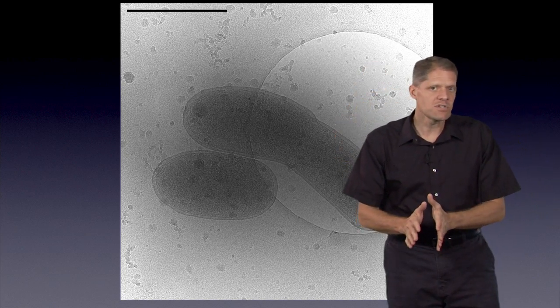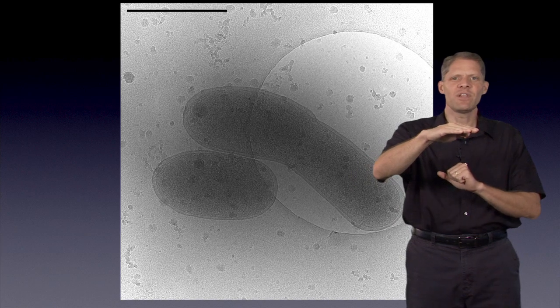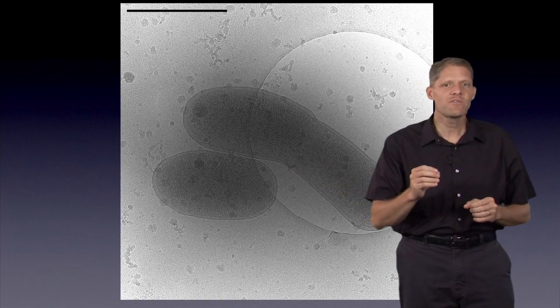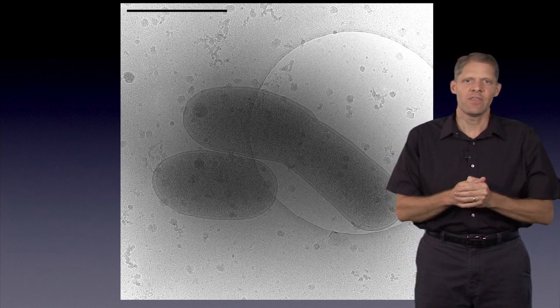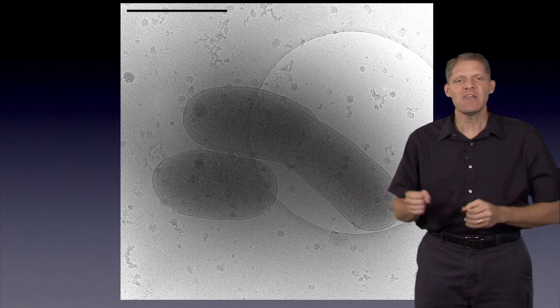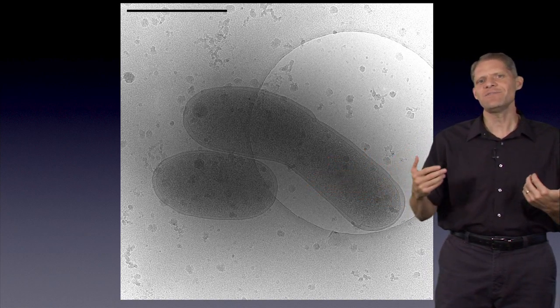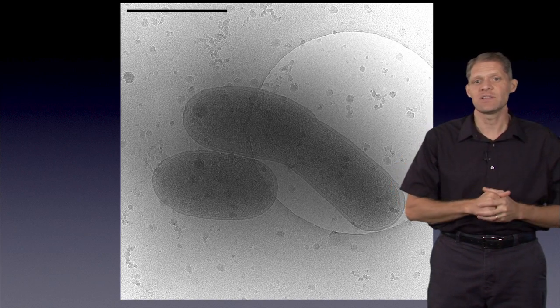And then by keeping it frozen constantly from the time it was plunge frozen until it's in the column of the electron microscope, we can then take an image through it. And so here's what you see. The great advantage is that we've preserved the cells in a near native state. In fact, it's been shown that if you take a grid like this and thaw it out in growth media, many of the cells will recover life and they'll begin to replicate. And so we're looking here at a cell in a native state, and all the molecules are where they were when we dropped it into the liquid ethane.